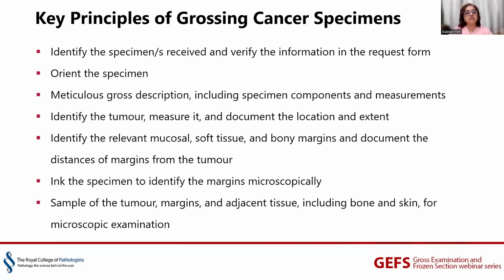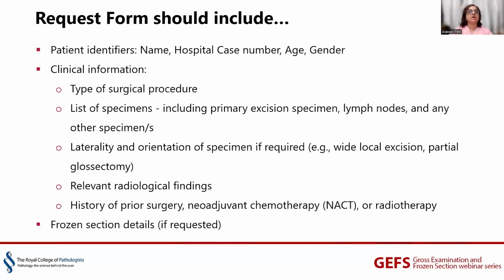Once you ink the specimen, we submit. This is an overview of grossing for all specimens. So once you ink the specimen, submit the margin, submit the tumor, adjacent tissue, including bone and skin, and all this is going for processing, which will be microscopically evaluated.